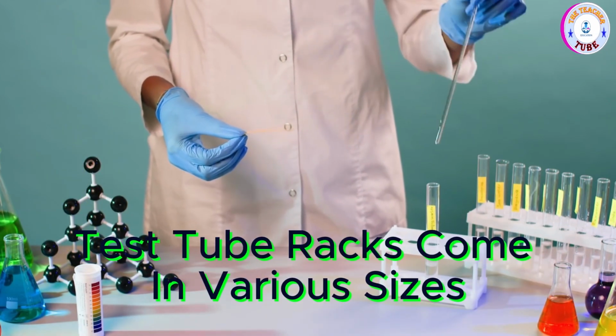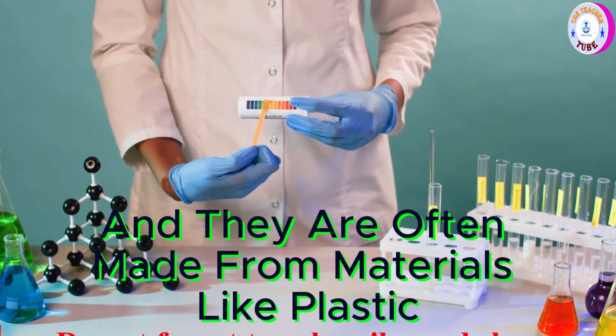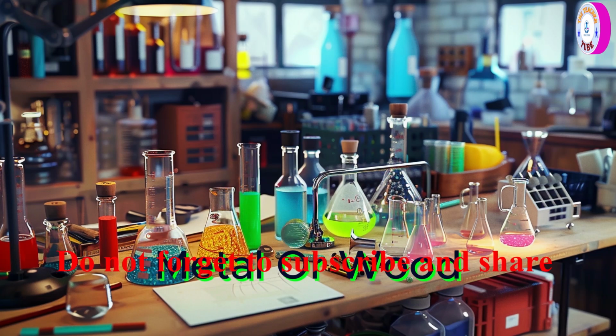Test tube racks come in various sizes to hold different numbers of test tubes, and they are often made from materials like plastic, metal, or wood.